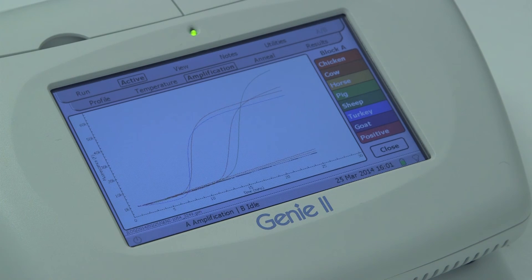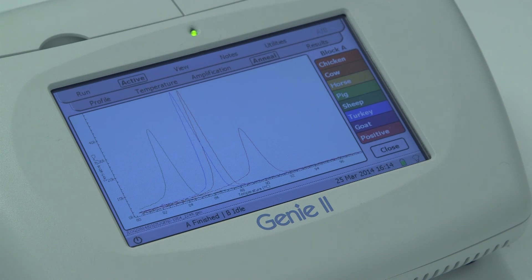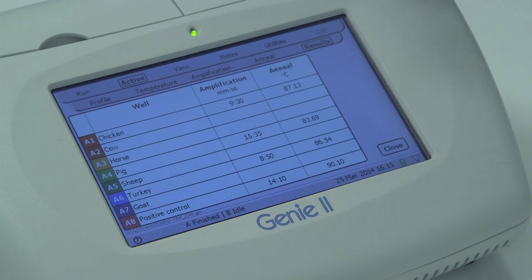In this test, we can see that the hot dog contained chicken, pork, and turkey. This shows how the Genie instrument and this assay can be used to give rapid and simple confirmation of the species of animal used.